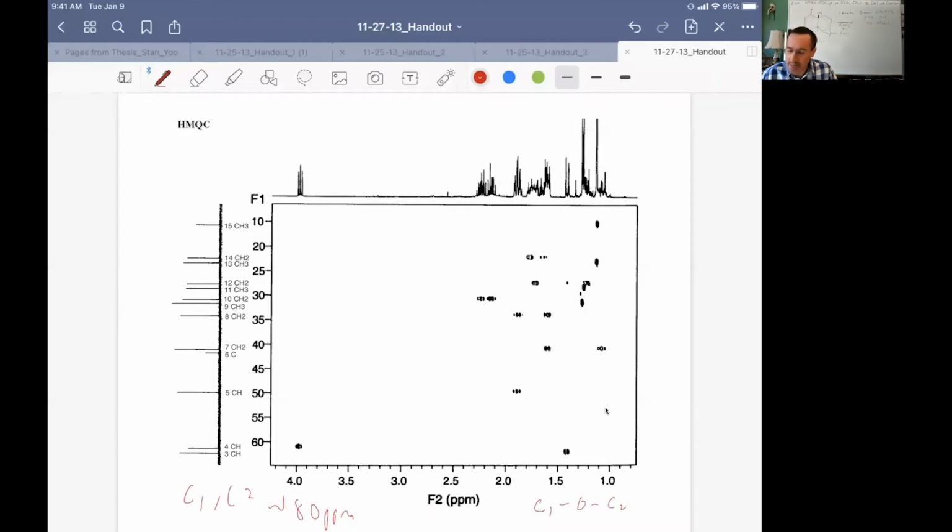I'm not even going to try to label these peaks A, B, C, D, because this area is just too much of a mess for me to make my way through. But when I look at the correlations, this peak comes up as correlating with this, that's correlating with number 4. Number 3, so 3 is a methine, 2 is over here. Those are about the only resonances that don't have some terrible overlap. So number 5 ends up over here, but we see there's another one over there.